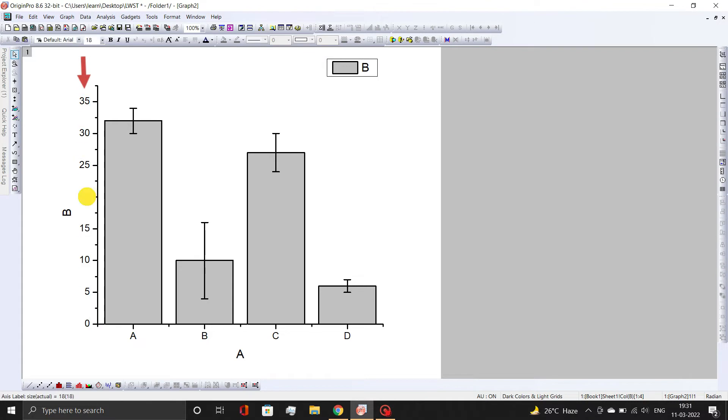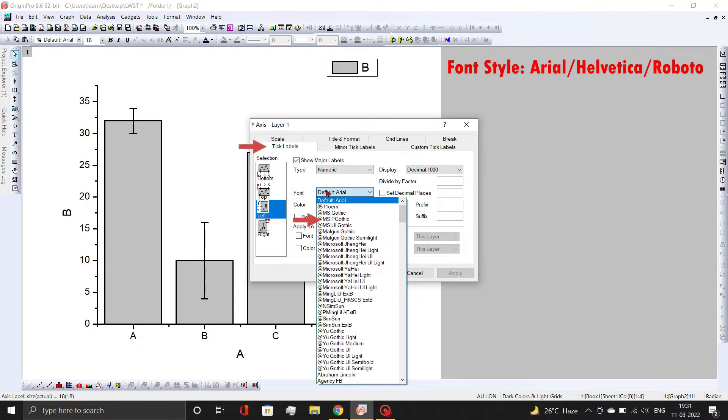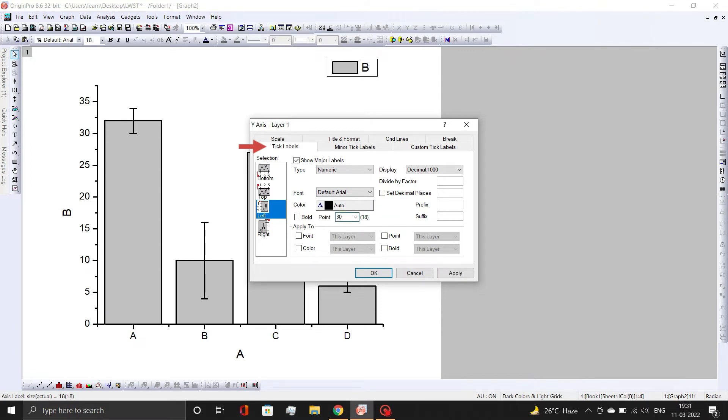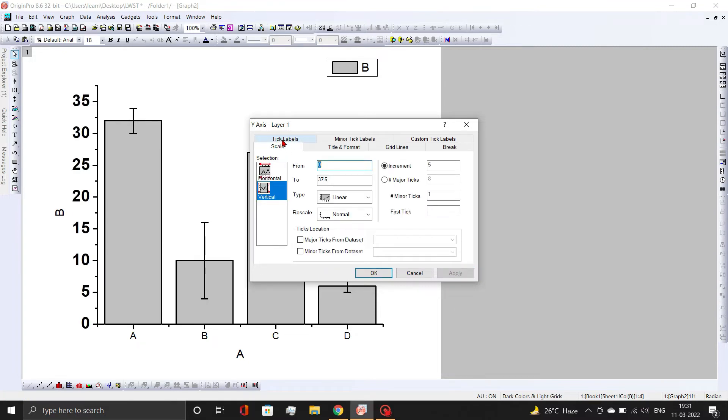Now change the axis properties. For tick labels, always try to use font styles Arial, Helvetica, or Roboto. Font size should be set to either 28 or 30 with bold. Also change the scale as per the requirements.